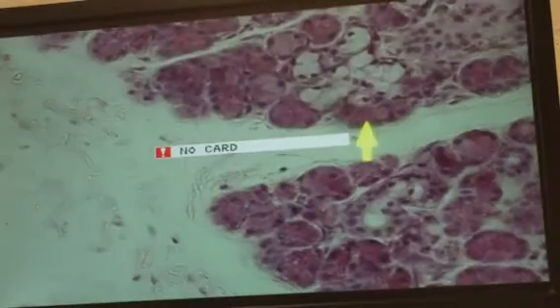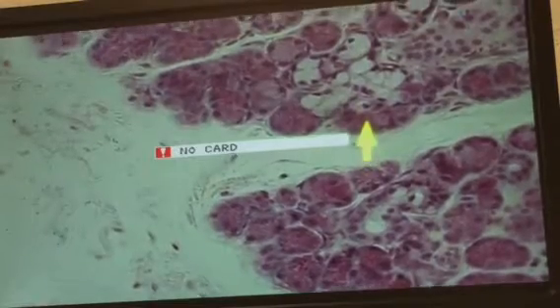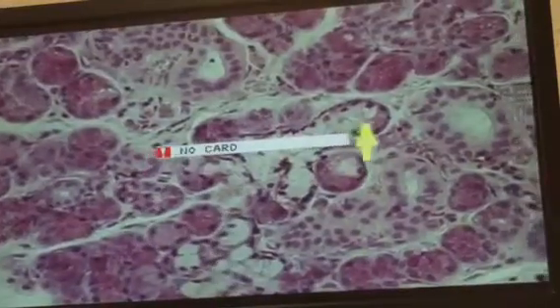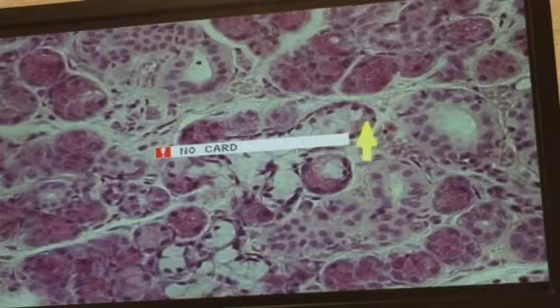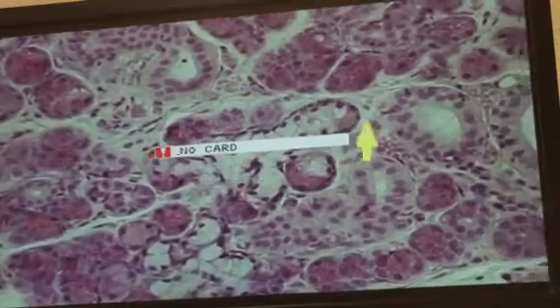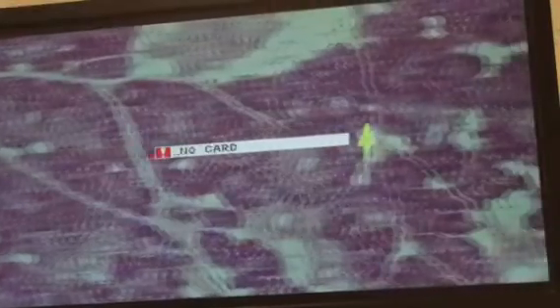And in those, we often find serous demilunes. So right there and right there. And there's a nicer one right there. So those mucus-secreting cells tend to be washed out. Kind of makes the boundaries between the cells stand out a bit more. And there's that serous demilune right there. Otherwise, the structures are pretty much the same, except this is a mixed gland. Intercalated ducts are going to be somewhat shortened. Striated ducts will be rather long.